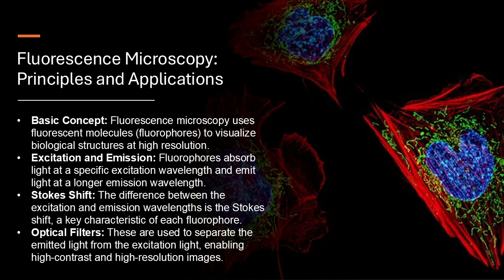Have you ever thought about how amazing it'd be to see the invisible world inside a cell? Like pinpointing a single protein out of millions? It is pretty wild. It's like trying to find a needle in a haystack, but on a microscopic level. Luckily, we have a tool that gives us that kind of superpower: fluorescence microscopy. It's how we can actually observe those intricate dances of molecules within living cells.